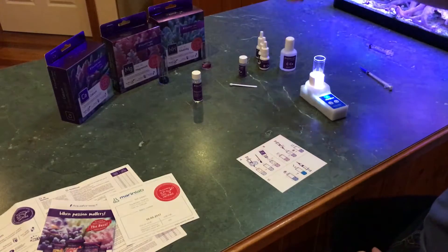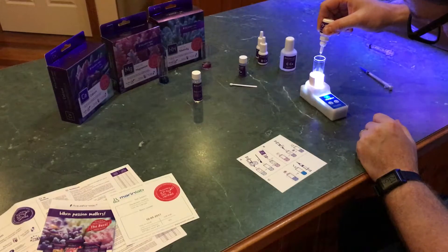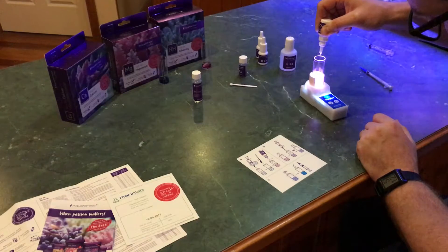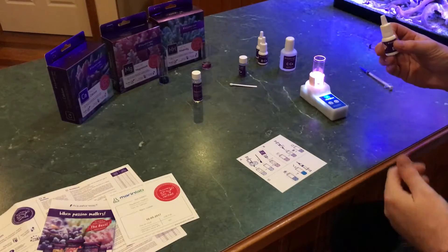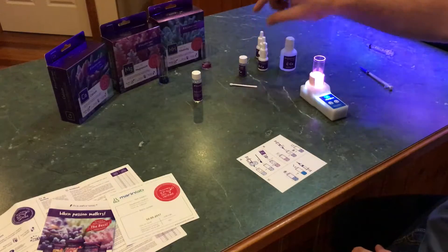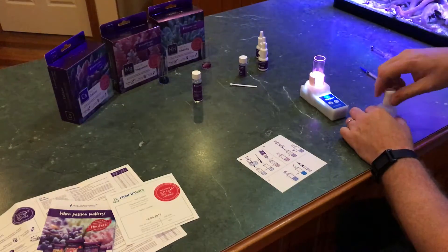Put that one aside. It doesn't say to shake Reagent B but I will. 10 drops of this — one, two, three, four, five, six, seven, eight, nine, ten. The other thing worth mentioning: some test kits as soon as you tip them half upside down the drops start flying out. This one you have to squeeze fairly hard, which is good — you're not going to get an accidental extra drip and have to start the test over. It says to stir that for five seconds.